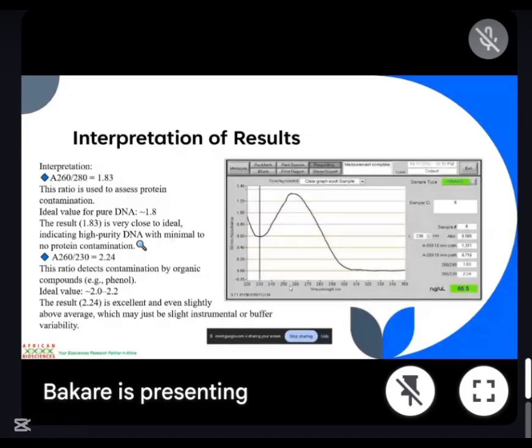With RNA, you see this 65.5 that I have. Even if all of these things, the 260/280 and 260/230, are good, this 65.5 for RNA cannot go anywhere, because the concentration for your RNA must range higher than that. You will say that okay, you have enough RNA from 200.